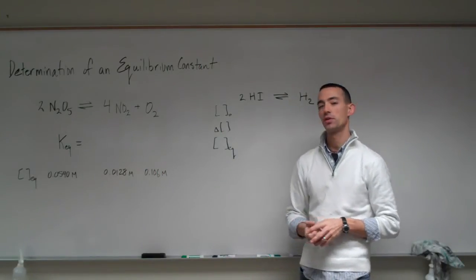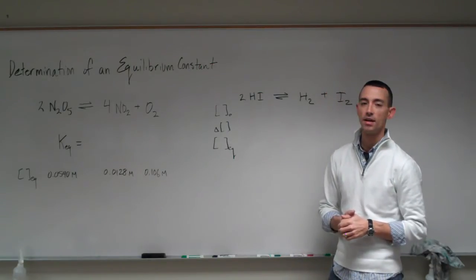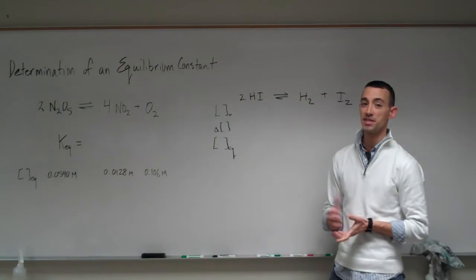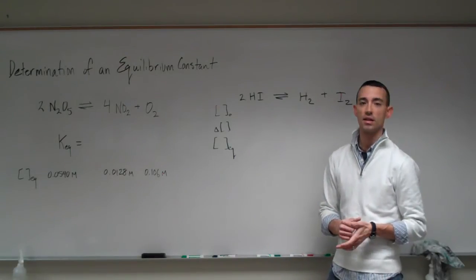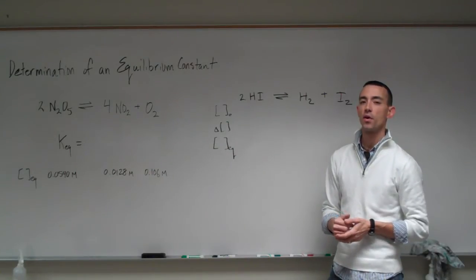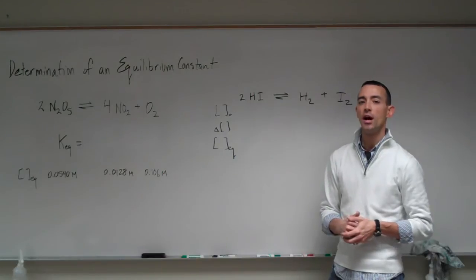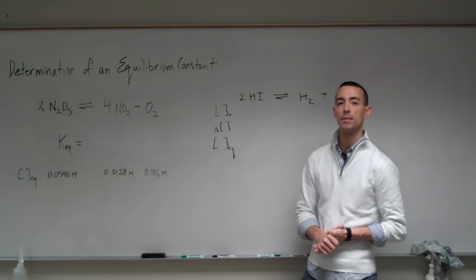This experiment is part of the General Chemistry 2 sequence at York College of Pennsylvania. The goal of the experiment is pretty clear. We're going to try to find the equilibrium constant of a reaction. The reaction that we'll be working with today involves the dissociation of an acid-base indicator. I'll get to the specific reaction in a couple of minutes.